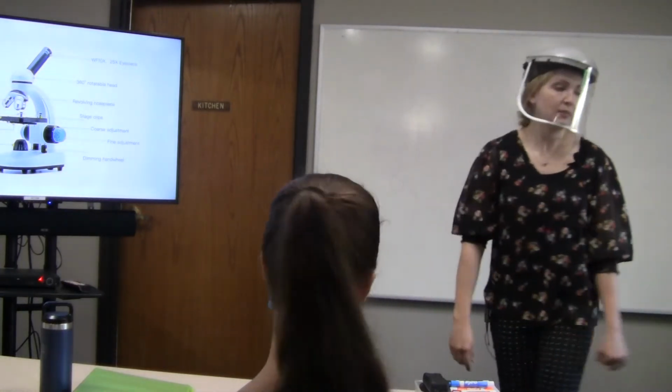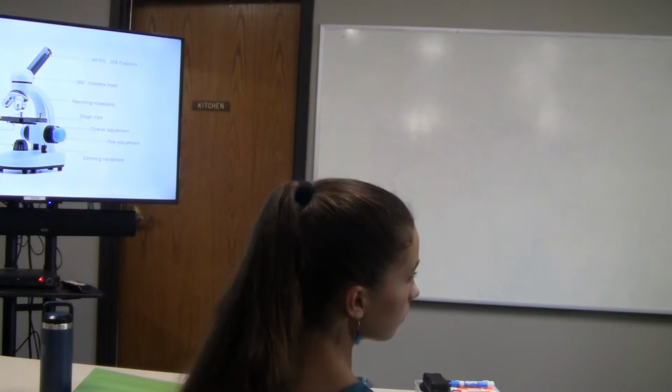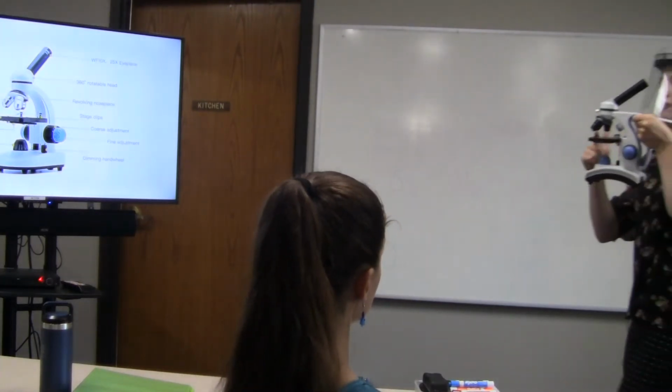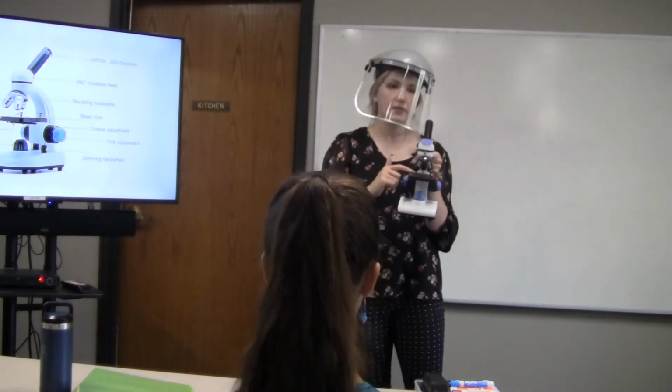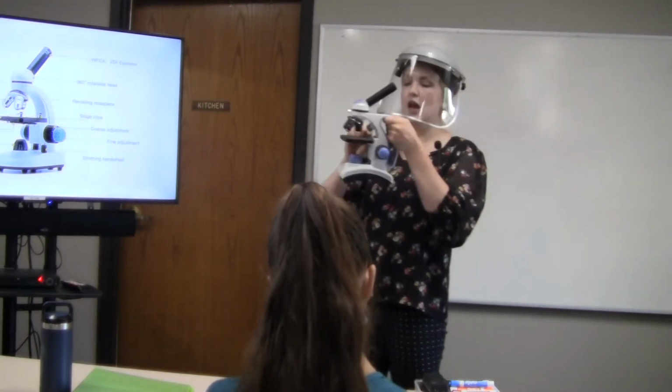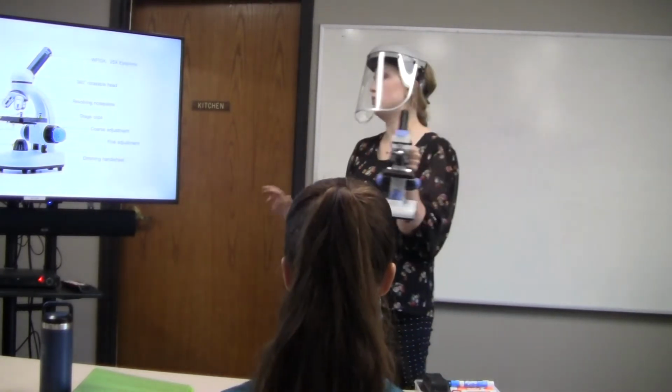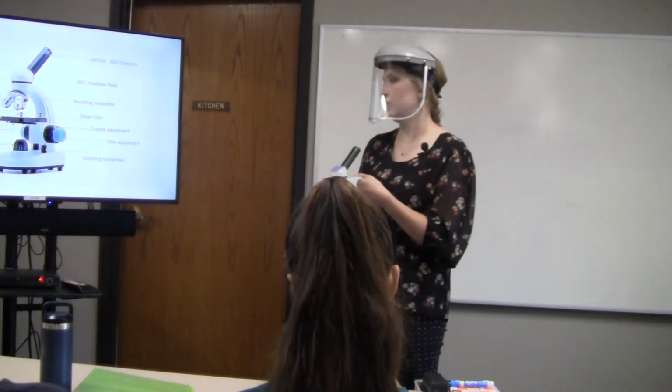So the stage is the platform on which you're going to place a slide to view. And you have these stage clips, which are going to hold the slide in place so it doesn't move around when you are looking through.